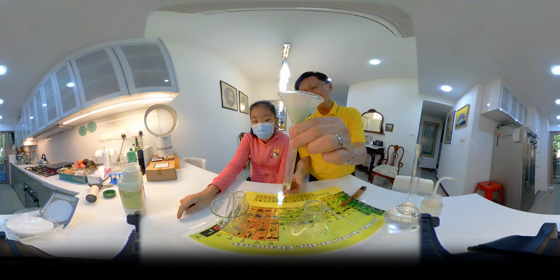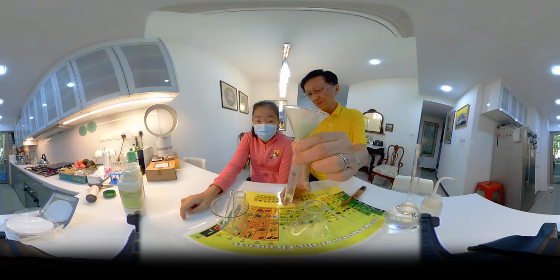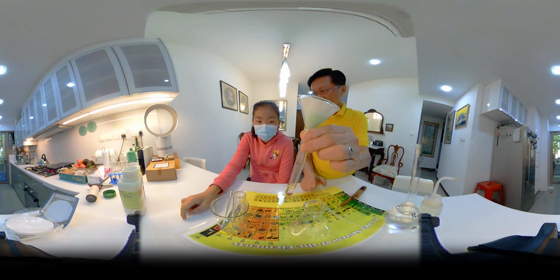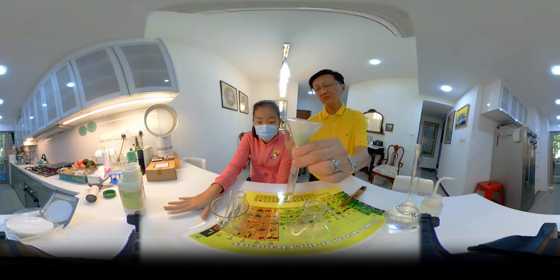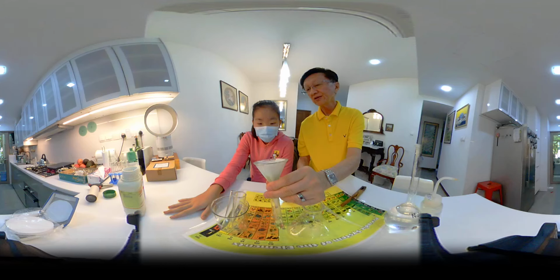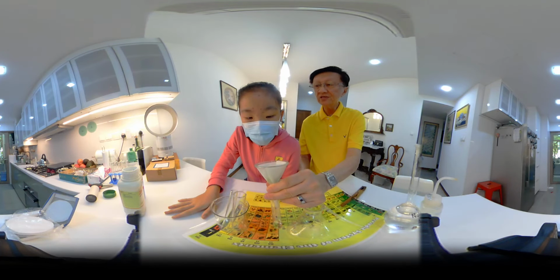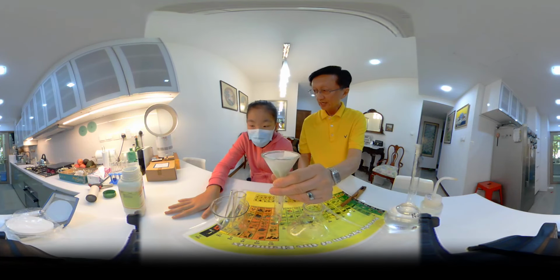So one way to remove the color of the solution is to precipitate out the transition metal hydroxide. And once the transition metal hydroxide has been precipitated out, in this case, the green residue that remains on the filter paper, can you see the green residue? Is actually nickel hydroxide.